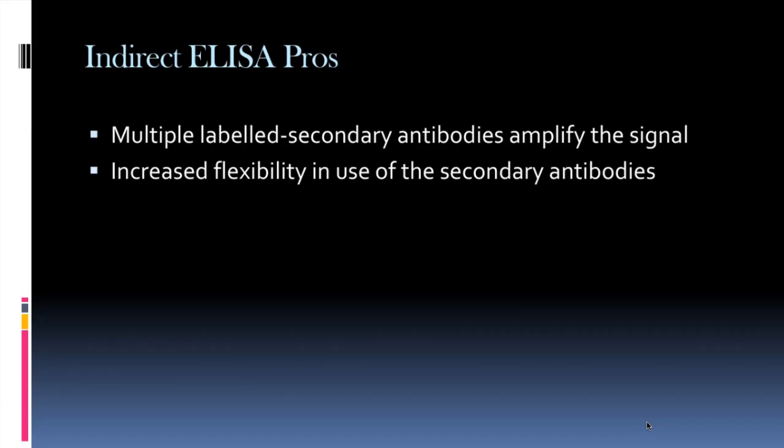Additionally, there is increased flexibility. So secondary antibodies aren't specific for the antigen, they're just specific for primary antibodies. And so you can, in principle, use the same secondary antibody for multiple different assays.